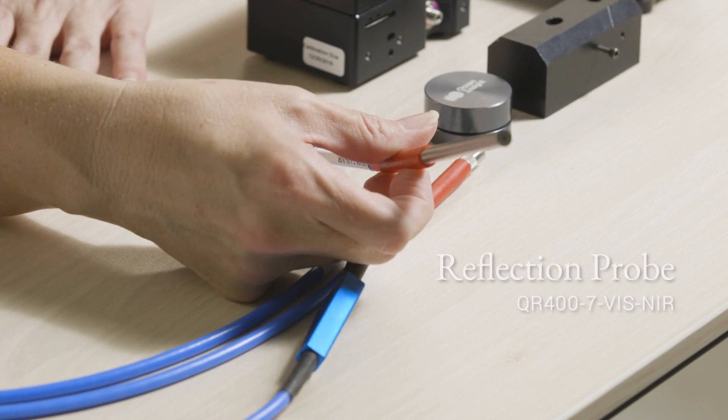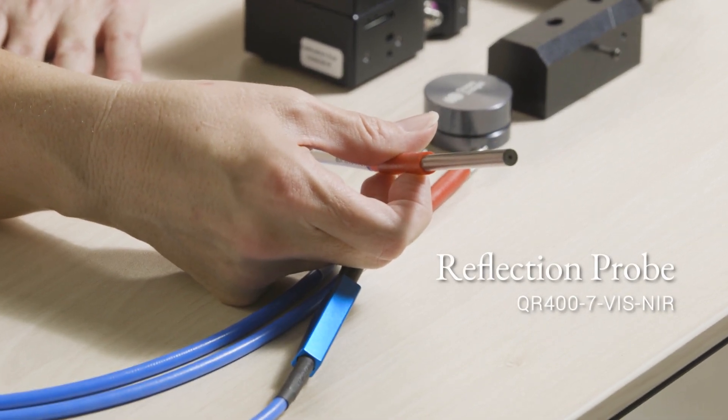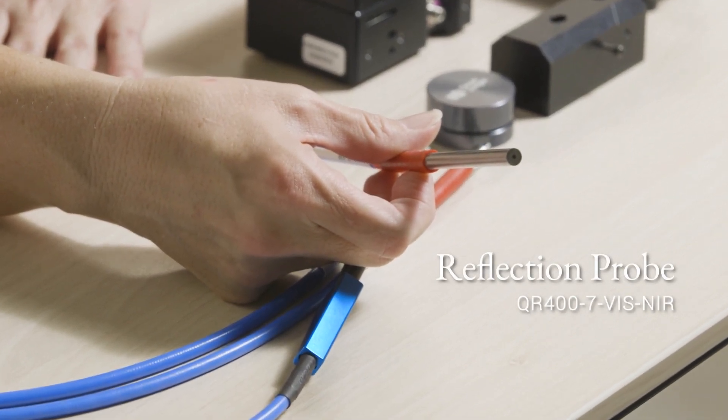Of course, the most important part of our setup is going to be our reflection probe, and this is going to enable us to couple our spectrometer and our light source to our sample for our reflectance measurement.